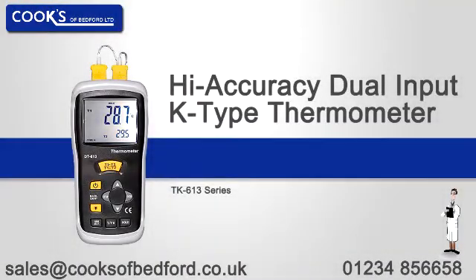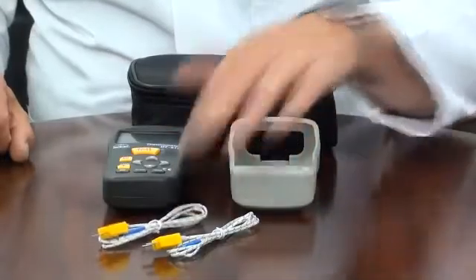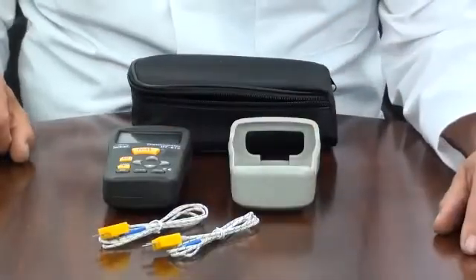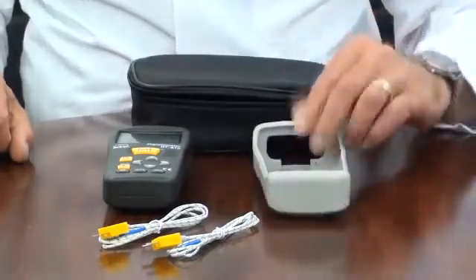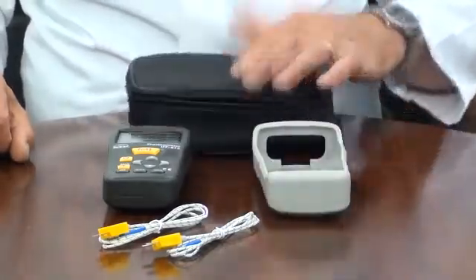An introduction to the TK613 dual-input high-accuracy K-type thermometer. It is supplied with two 1m long plug-in wire thermocouple probes, a rubber protective holster, a soft carry case, and battery.